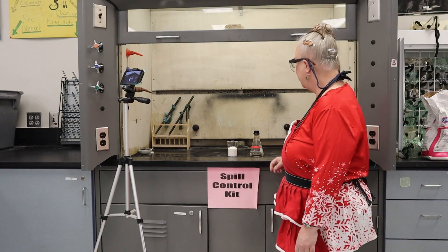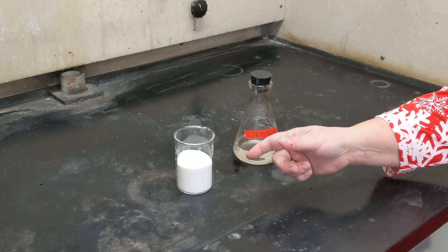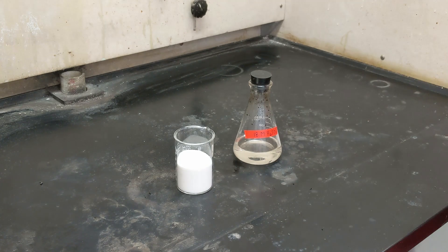Hello again, boys and girls. We have another demonstration here. This is sugar, just straight out table sugar, and this is sulfuric acid.